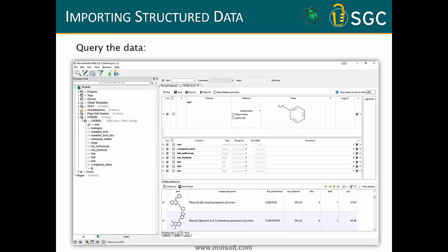Yeah, it's really tricky. The problem is not Scarab, the problem is the firewall, right? If the institute is not going to allow you remote access to the database, then Scarab is not for you. Scarab is something that runs locally on your PC. It's not something that runs on the server per se. So all the magic happens on your desktop, either on Windows, Linux, or OS X. And it needs to have direct access to the underlying databases that you are integrating Scarab into. There is no other way around that.